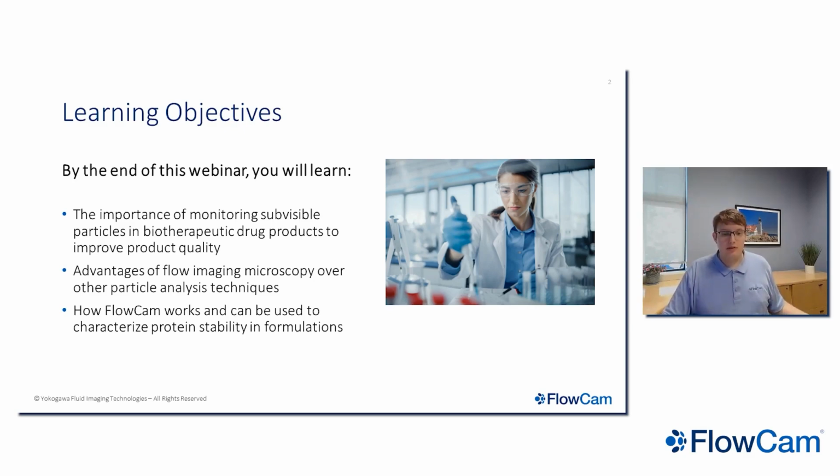We'll talk a little bit about flow imaging microscopy and FlowCam, a little bit about how the technique works, and some of the advantages this technique has over other common particle analysis methods. We'll then conclude talking about some applications for FlowCam technology, including using it to monitor particles in protein formulations, as well as particle monitoring in other types of biotherapeutics.